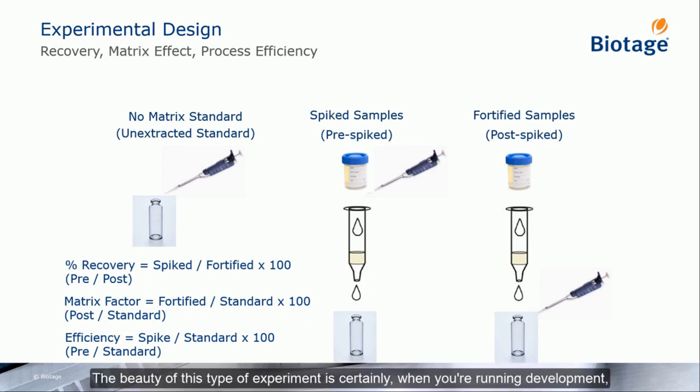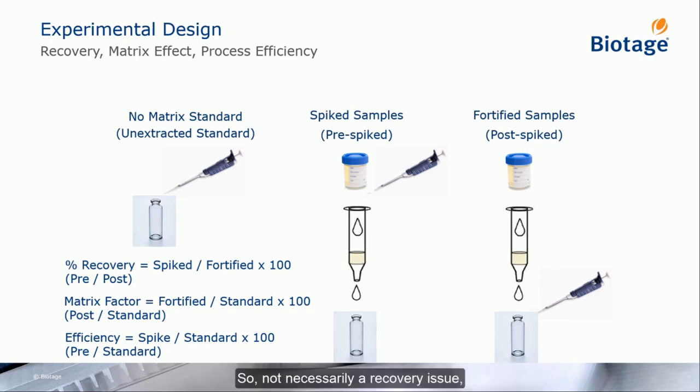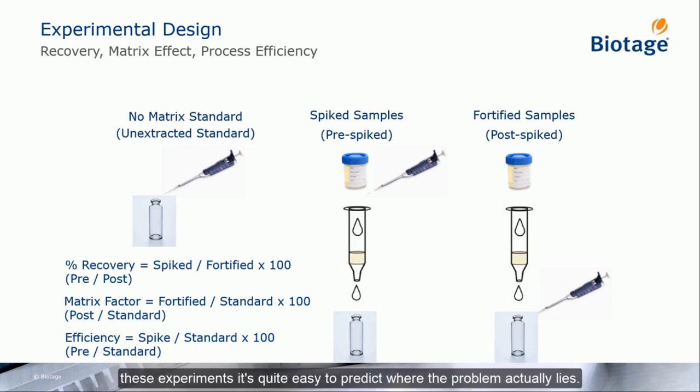The beauty of this type of experiment, certainly when you're running development, it can quite quickly predict where you're having the problems. So not necessarily a recovery issue, could be a suppression issue, and by running these experiments, it's quite easy to predict where the problem actually lies.